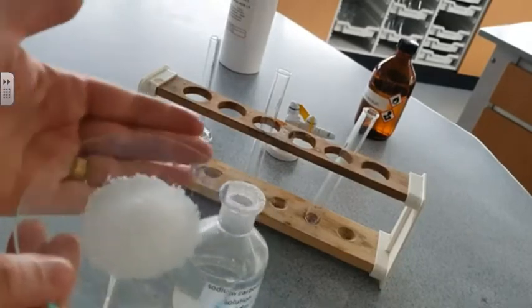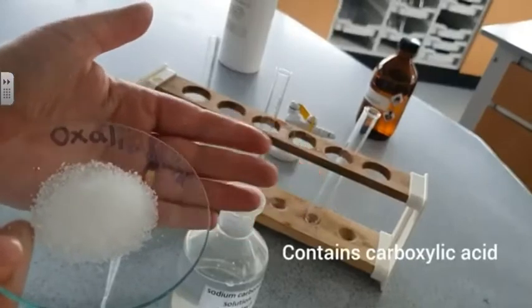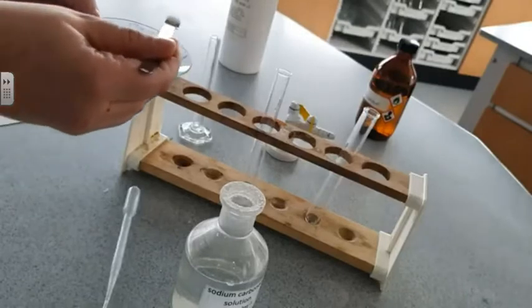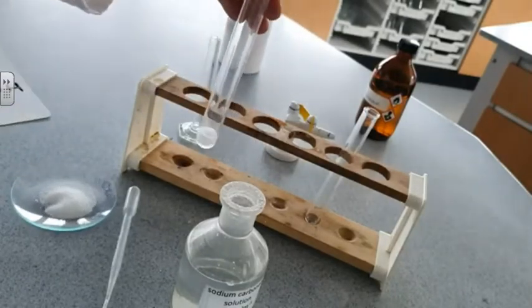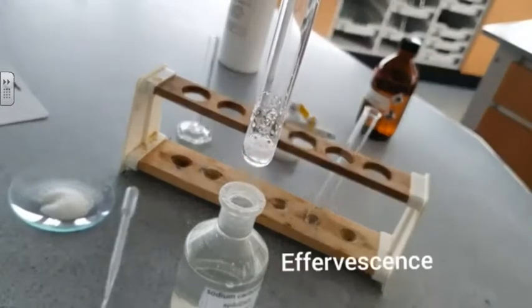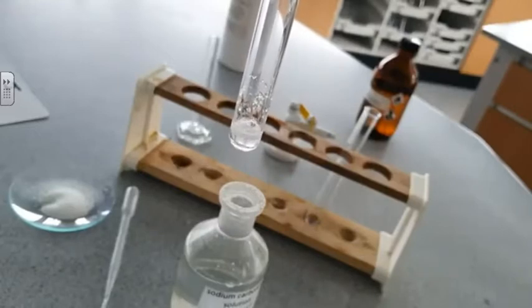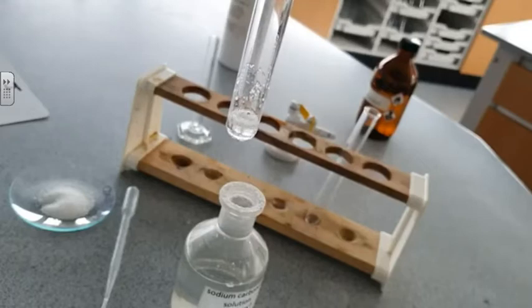For this test we've decided to test oxalic acid. Oxalic acid contains a carboxylic acid group. If the test works, we should see the fizzing, the effervescence due to the evolution of carbon dioxide gas. There we go, we've got effervescence, fizzing in the test tube. Oxalic acid must contain a carboxylic acid group.